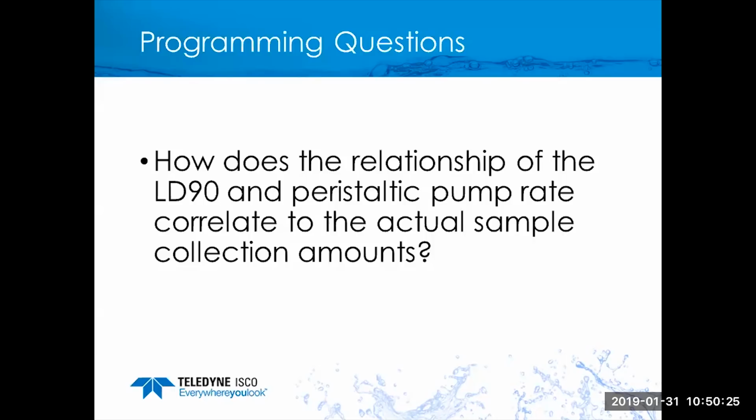If, for example, you change the interval time between samples from, say, 15 minutes to 30 minutes, it should save and maintain that setting. If you change the volume delivery, if you change it from, say, delivering 100 mL to delivering 200, it should save and make that change should still be present upon next use.